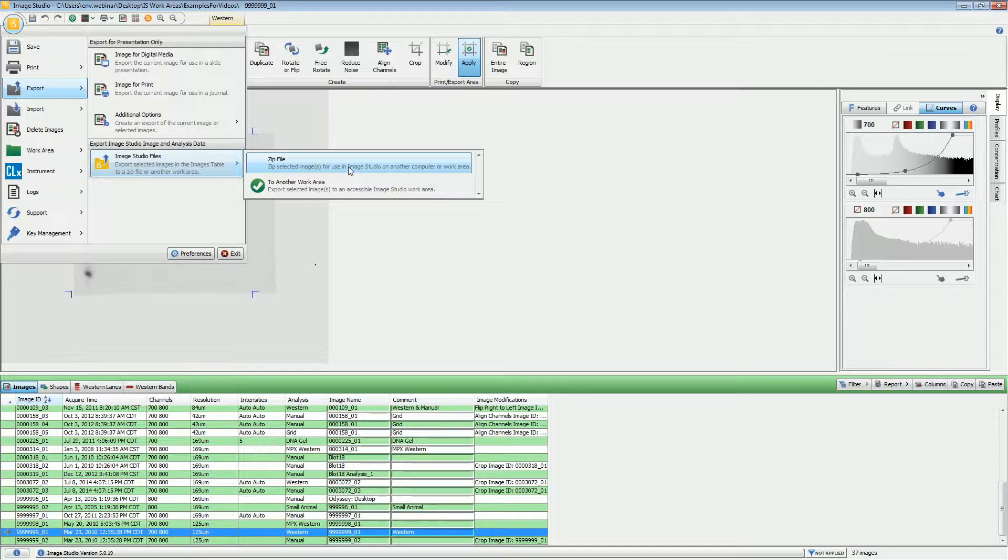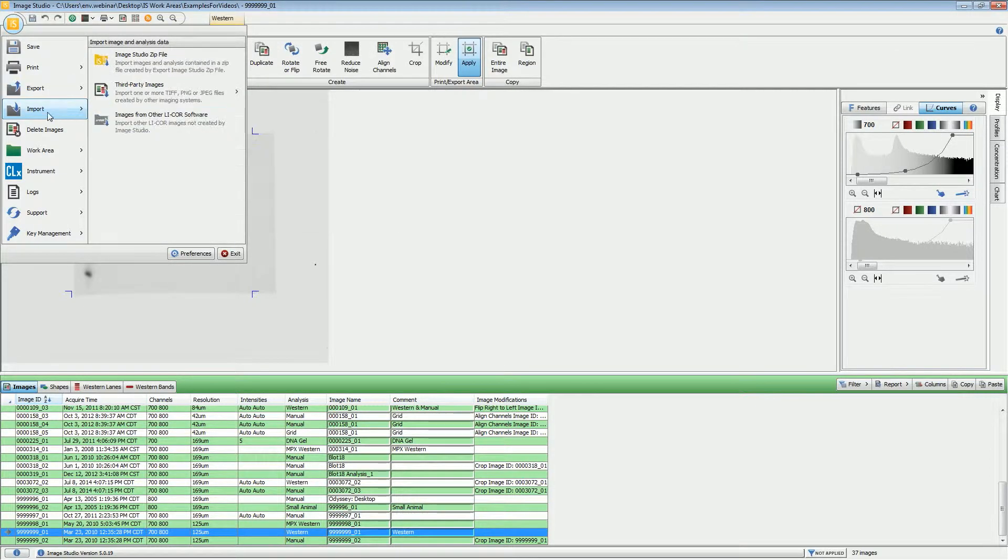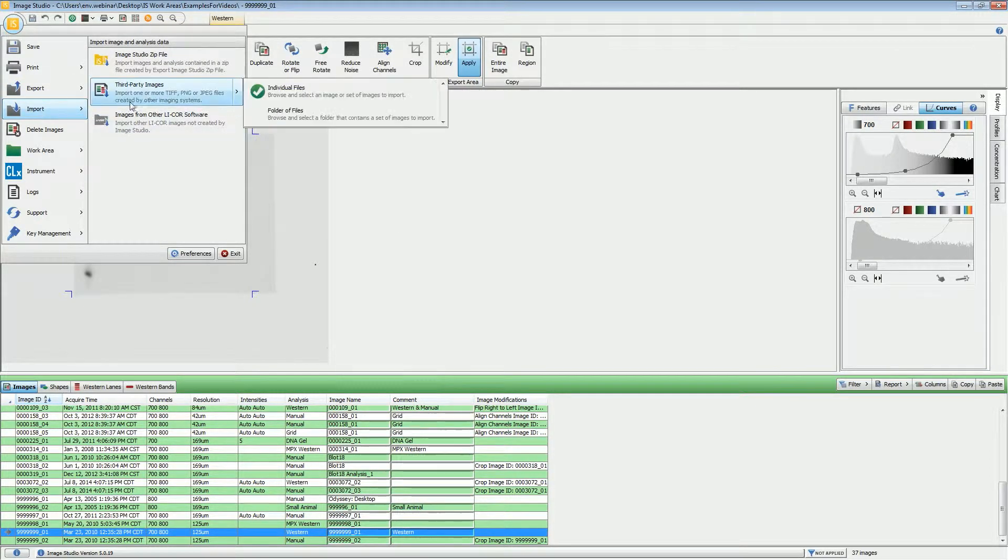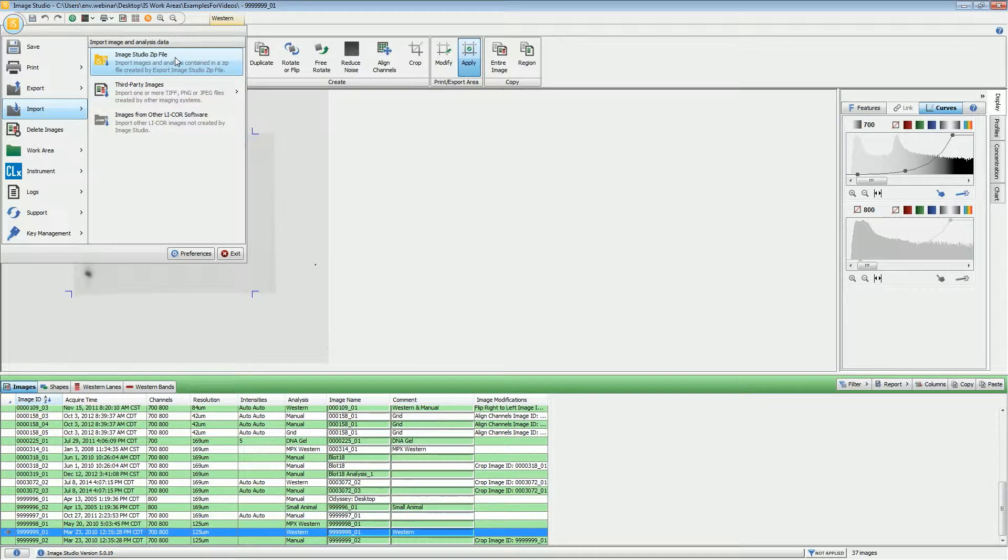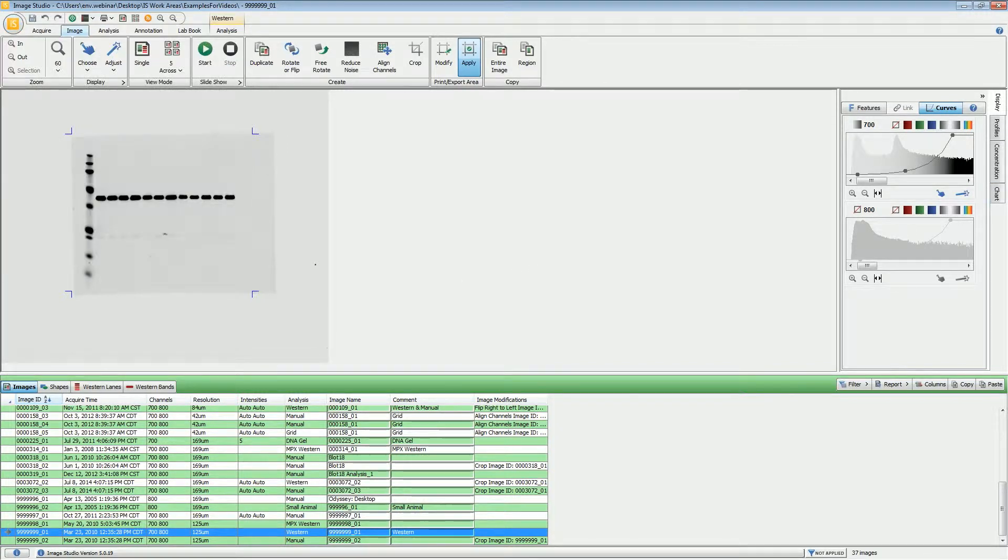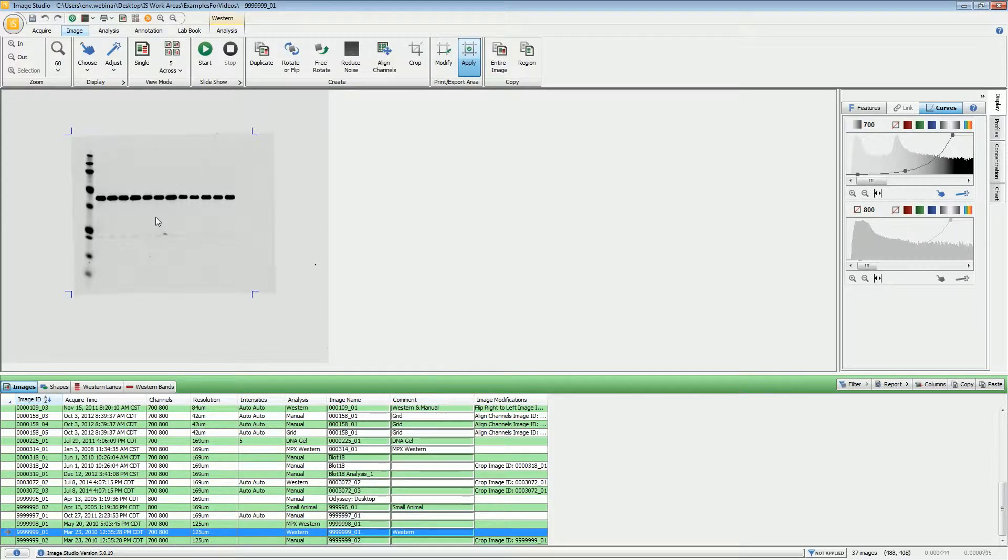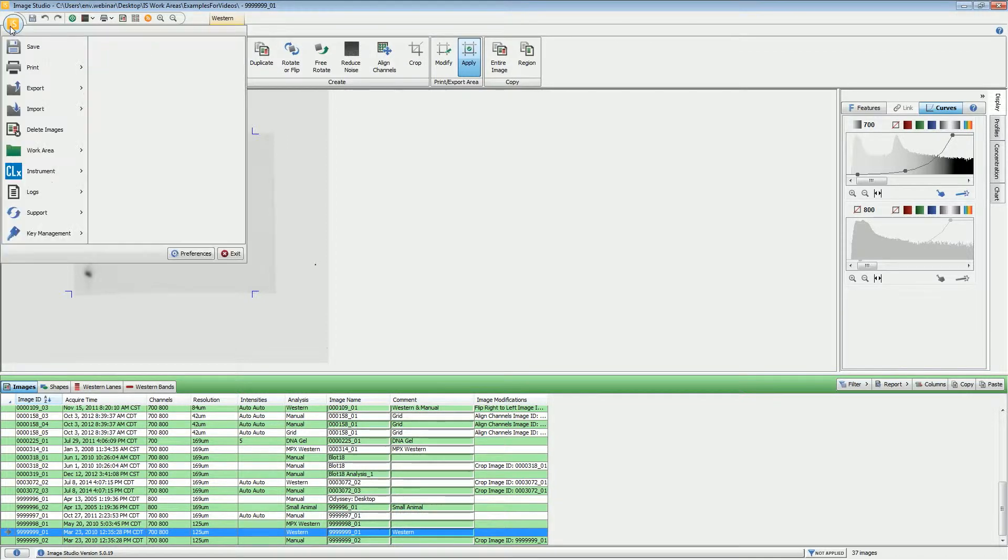Then, on the other computer, what you will do is import that Image Studio zip file. If you have made any adjustments to the image as far as brightness and contrast or the histograms, or if you have started an analysis, all of that information will be brought along with it.